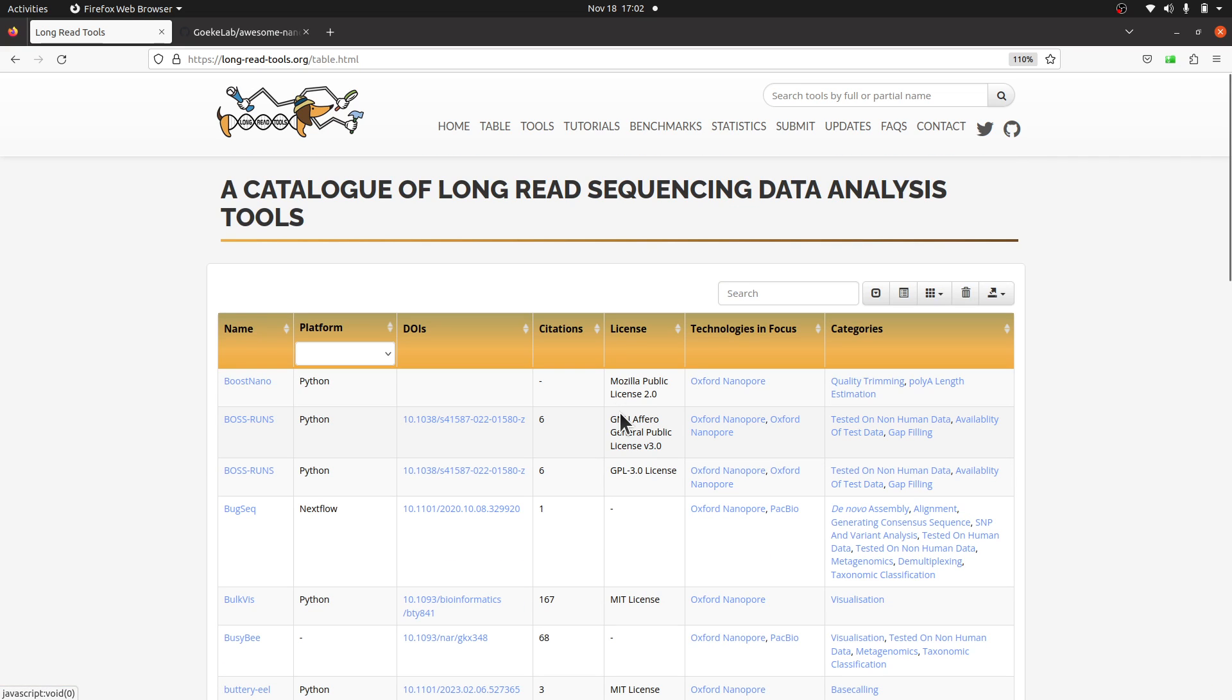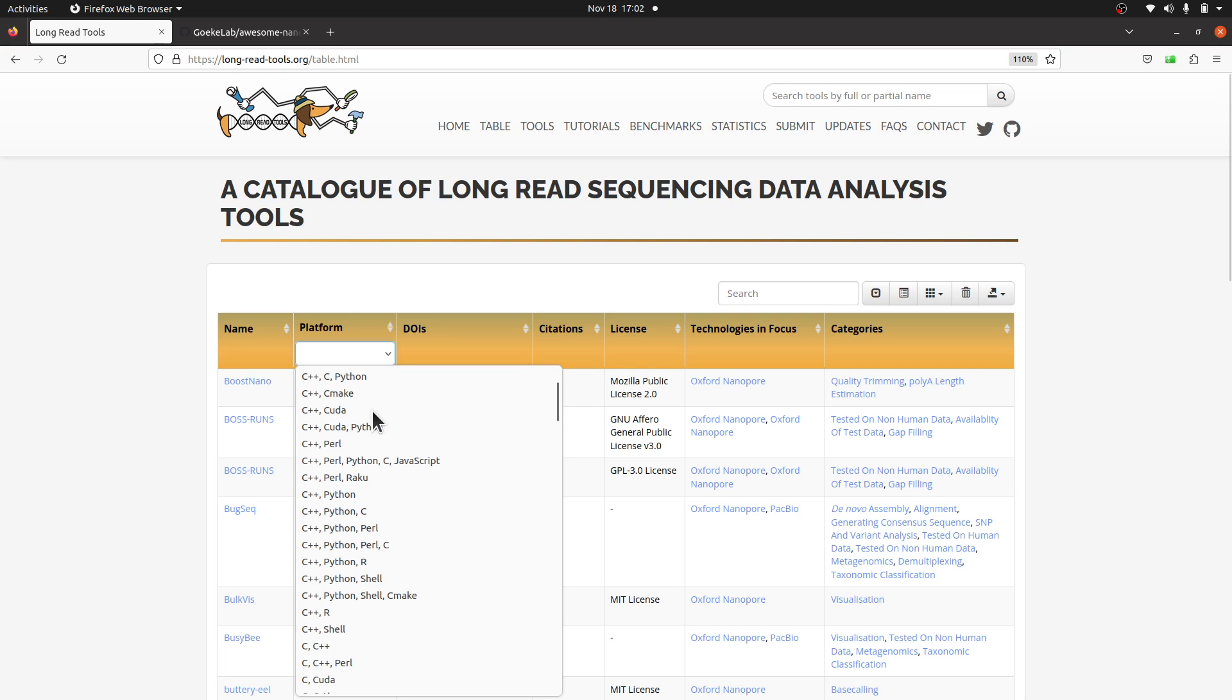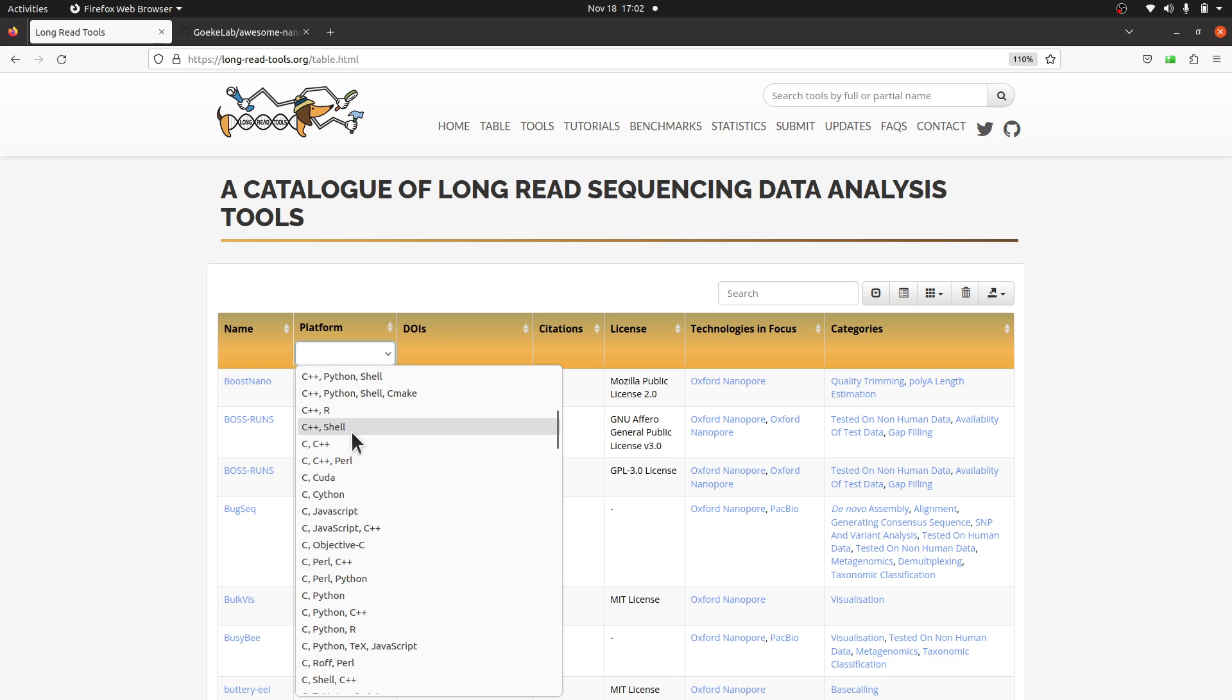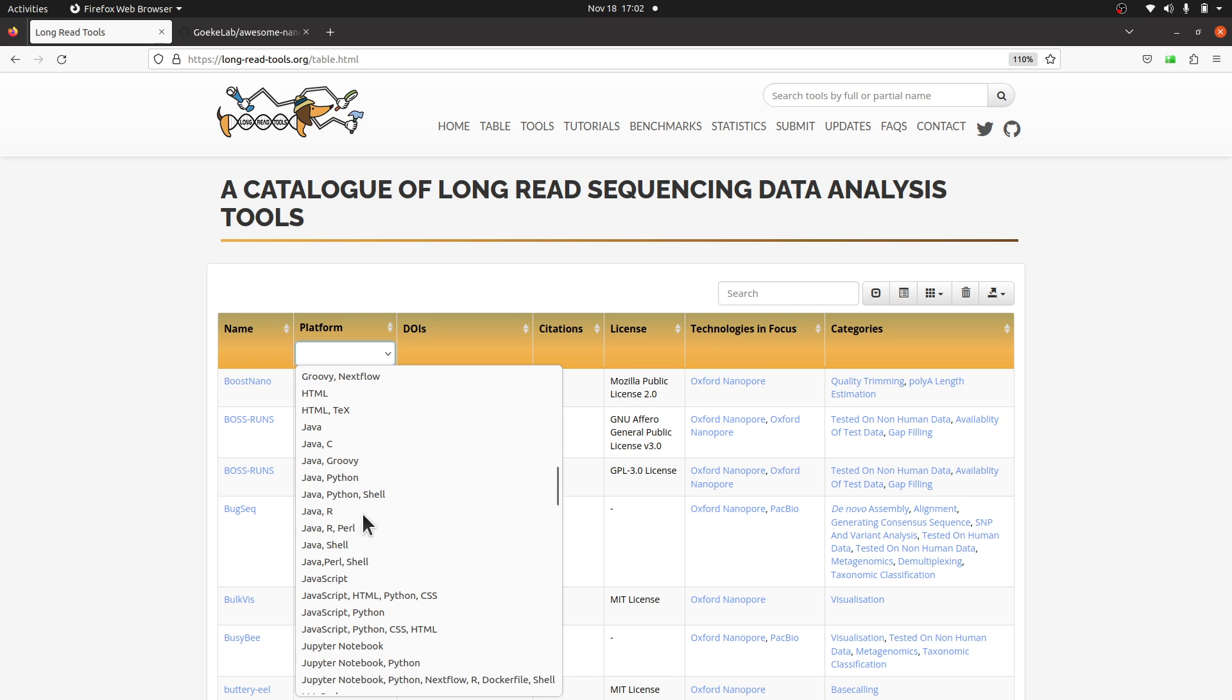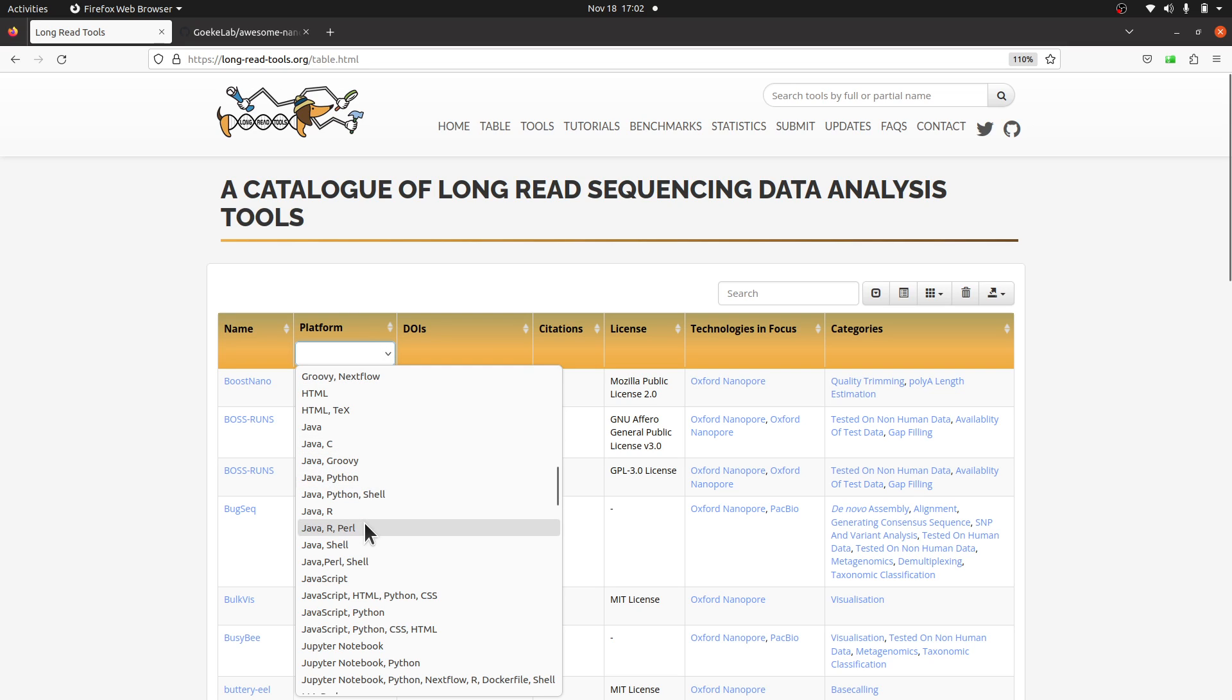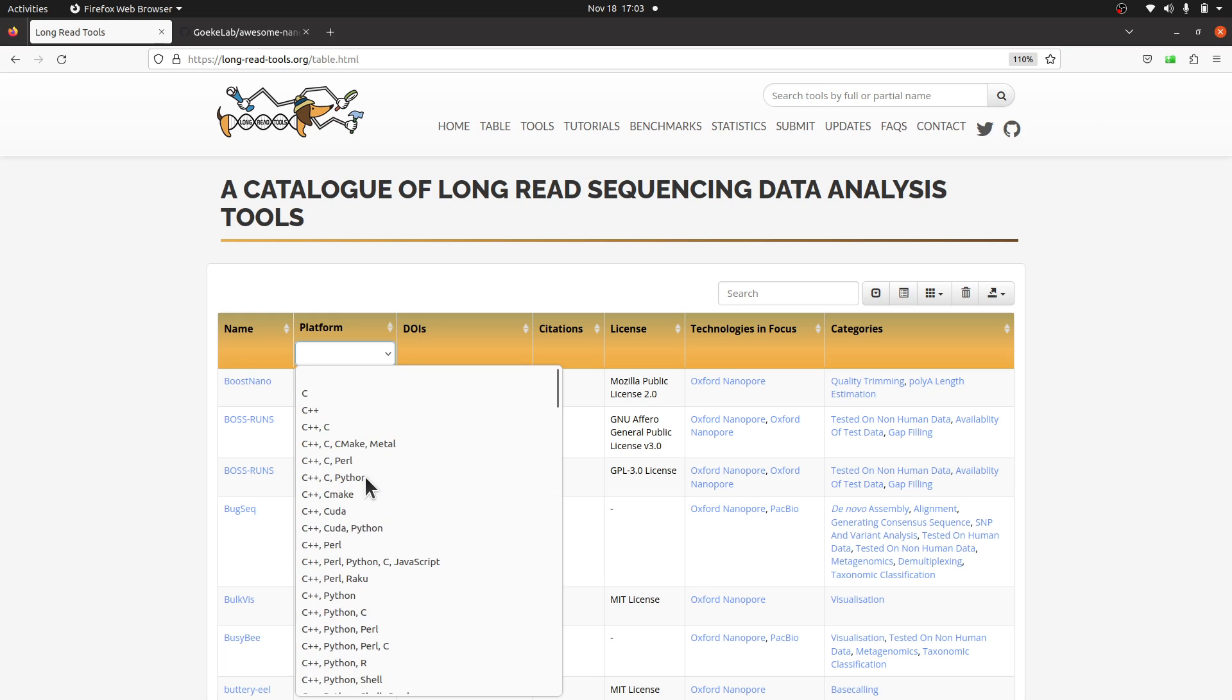When you come to platform, you can filter by platform. So when you are here, just come to platform, click it, and you select the platform. Some of them were developed in Python, some in C, some in C++, some are Shell. You are an R expert or a Python expert or C expert—you may want to go for a tool that you'll be comfortable using. So when you are here, you can just check it out.